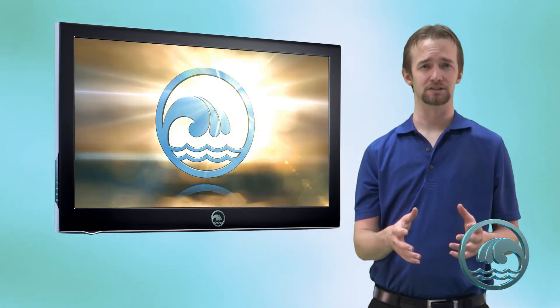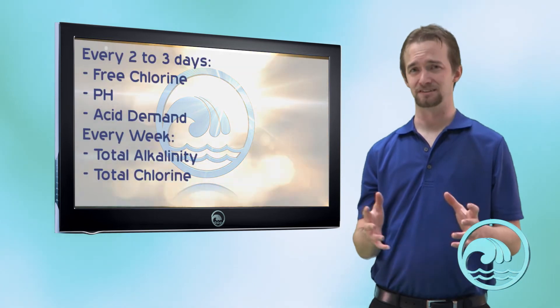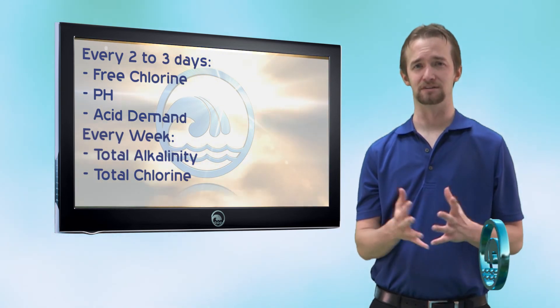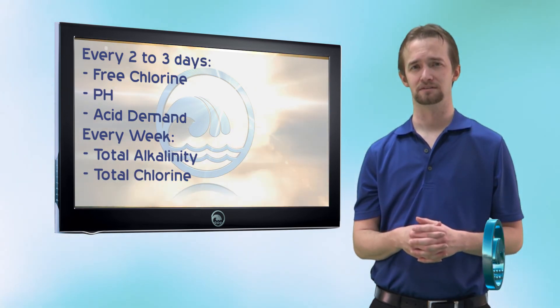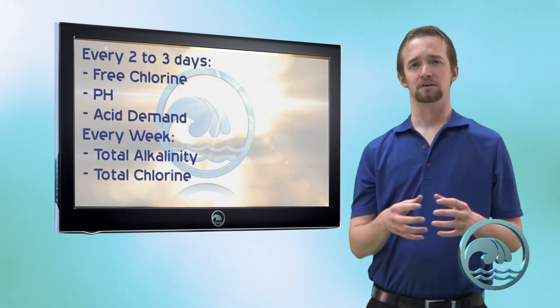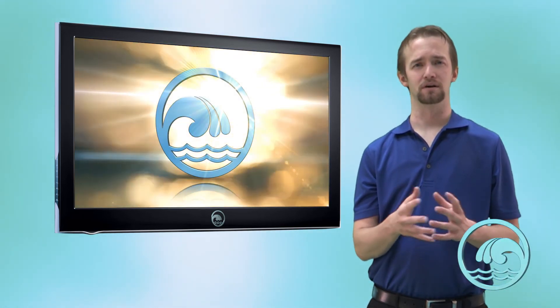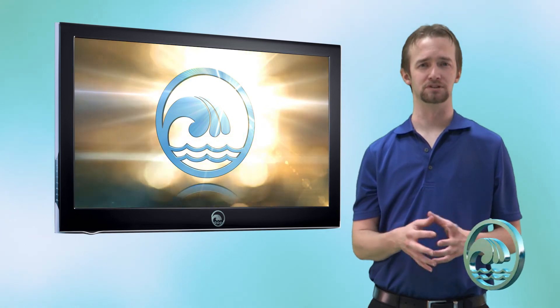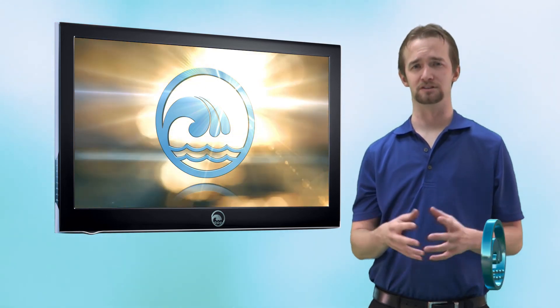Free chlorine, total chlorine, pH, and total alkalinity are what we can test for with this kit. For testing frequency, you want to test your free chlorine and pH every two to three days — some kits recommend daily, but that may be excessive unless you're heavily using the pool. Test your total alkalinity and total chlorine weekly. Now that you know how to use the K1004, test your pool water, get your results, and using our online water testing module, input your results to get a proper treatment table with video instruction on how to treat your water. I hope this has been helpful — thank you for choosing RiverbendPoolSupply.com for all your swimming pool needs.